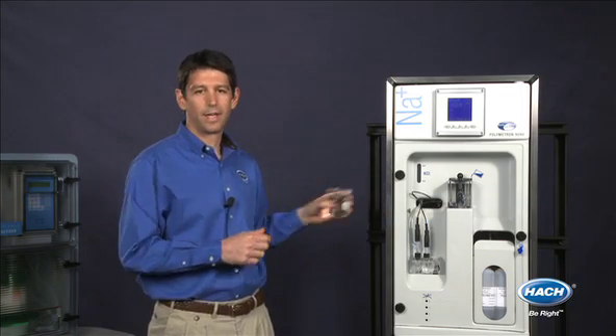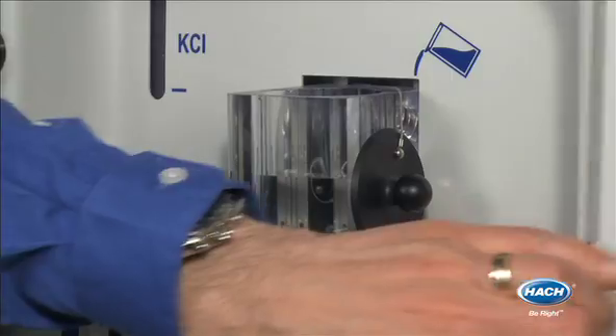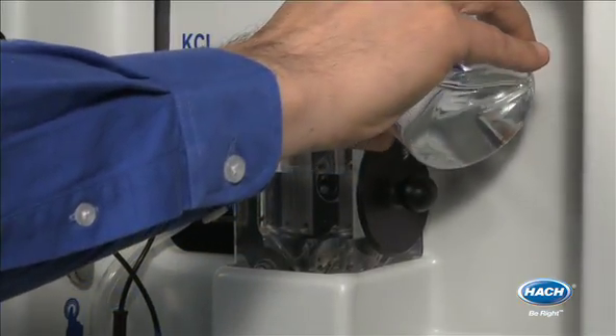And if you want to make sure your other analyzers are working correctly, or check the sodium concentration from non-monitored streams, you can very easily pour your sample into the overflow vessel.